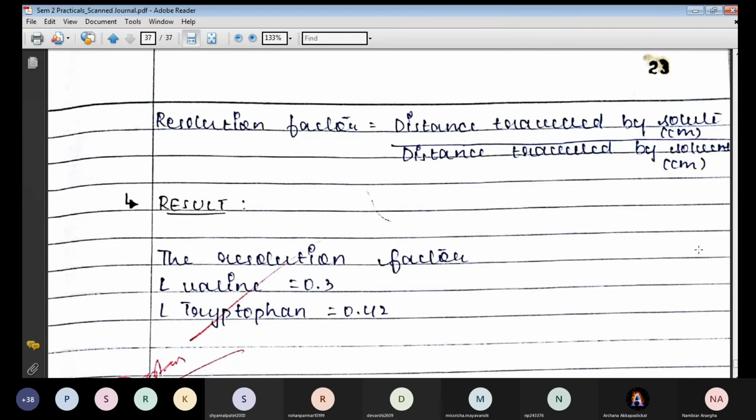Then why is it necessary to pre-saturate our solvent chamber? What does the RF value range tell us? What is polarity? How does polarity play a very big role in the separation of mixtures? So chromatography principles, types of chromatography, basics of chromatography, on what principles separation occurs.